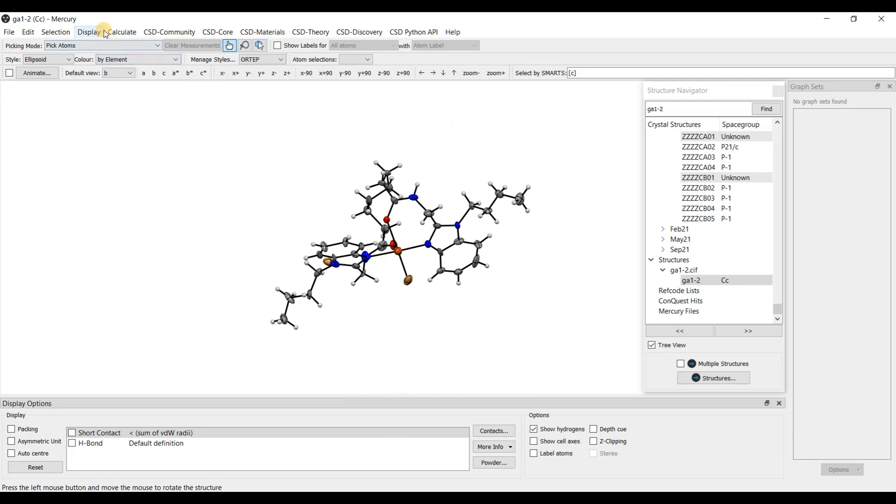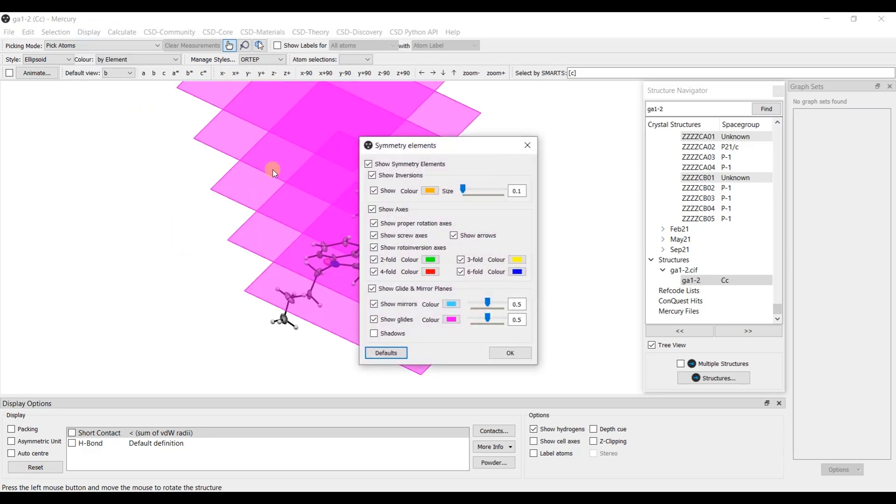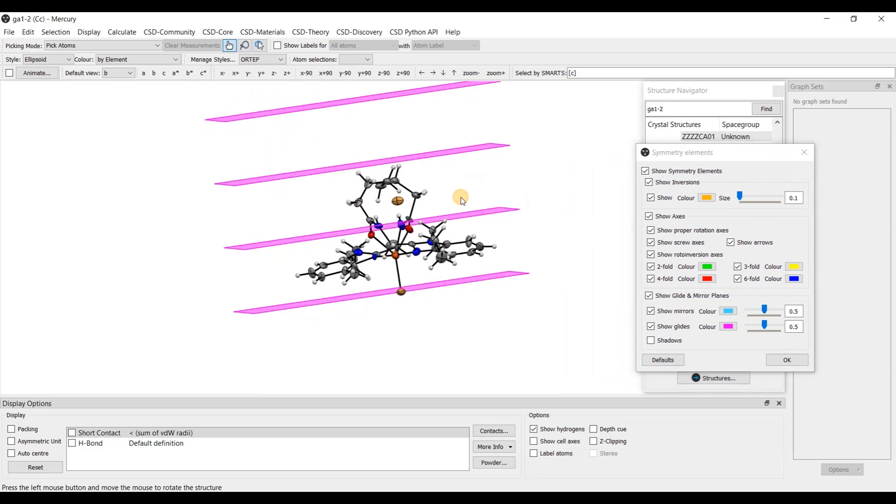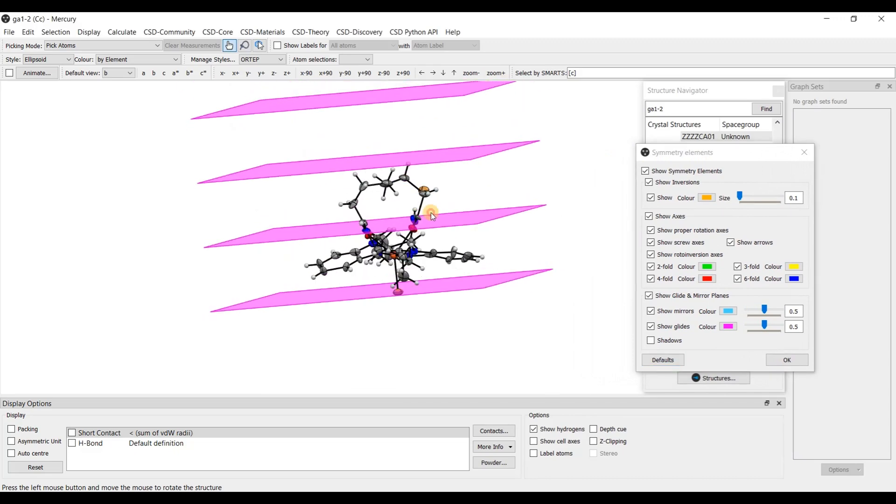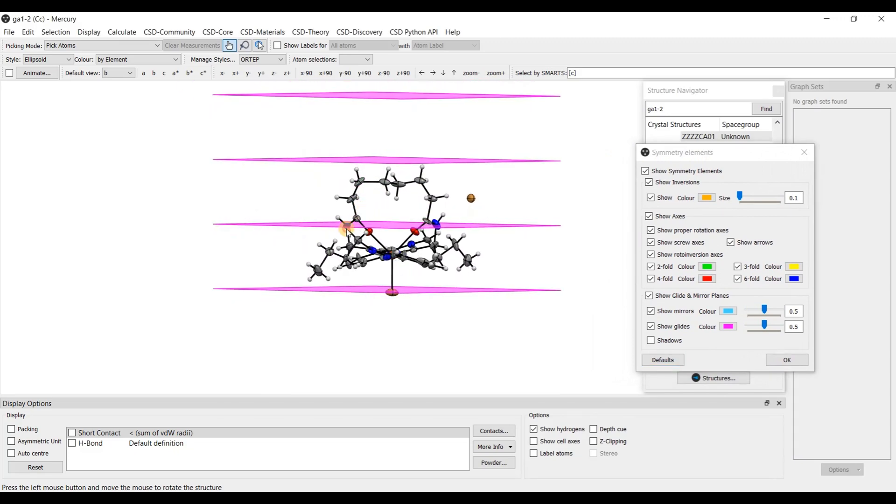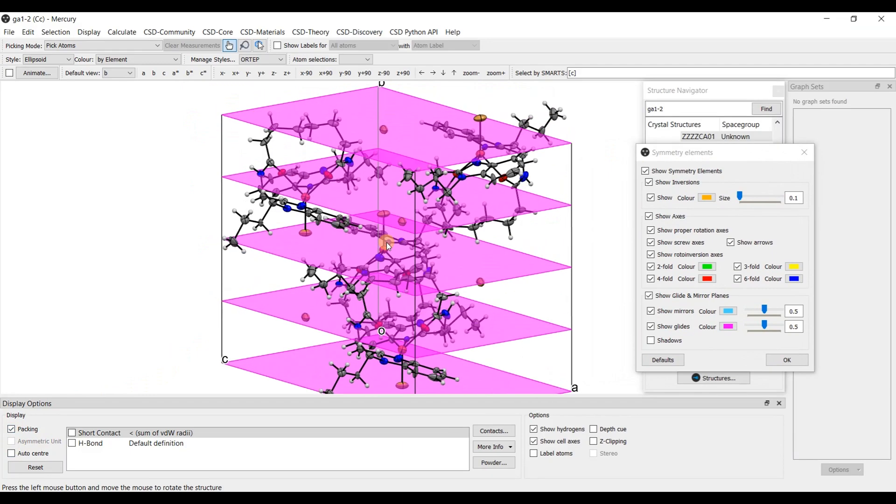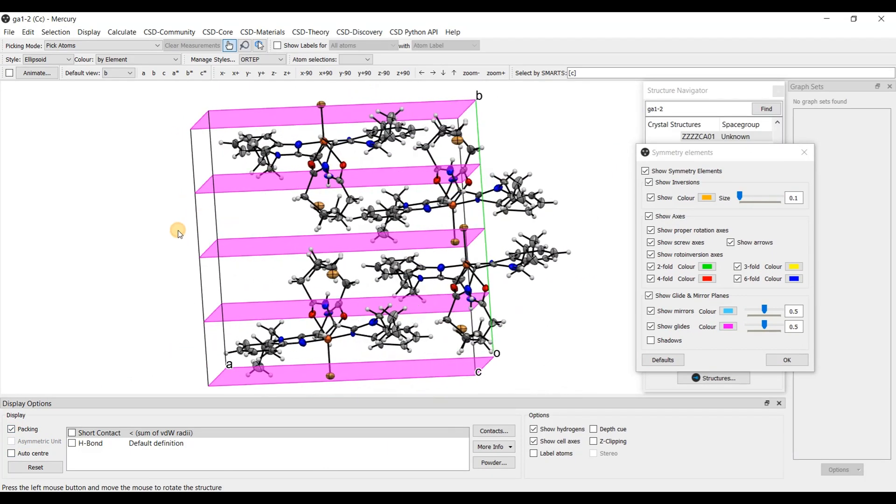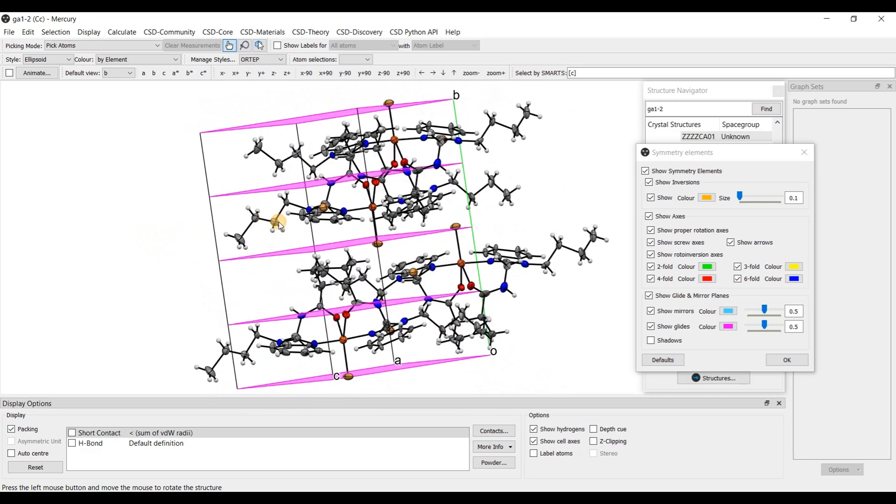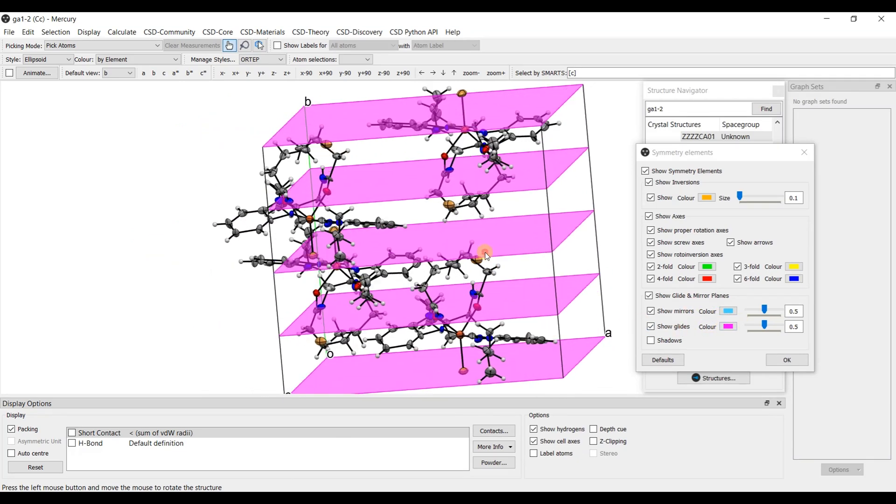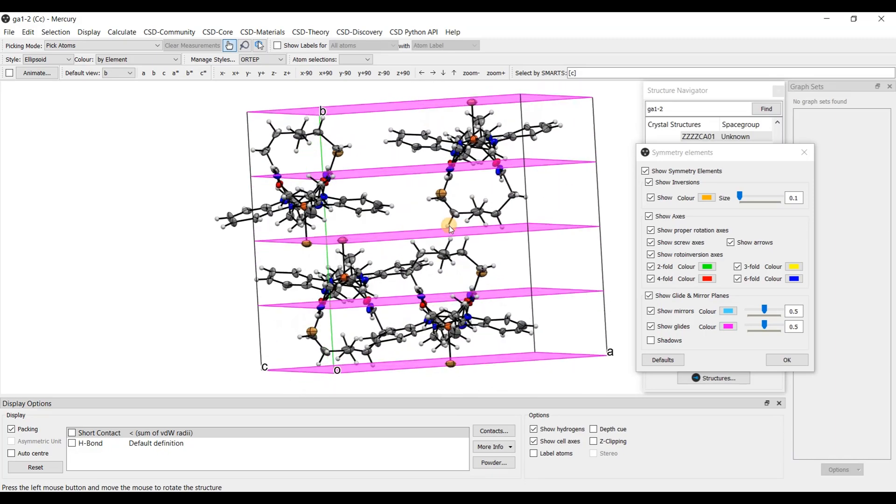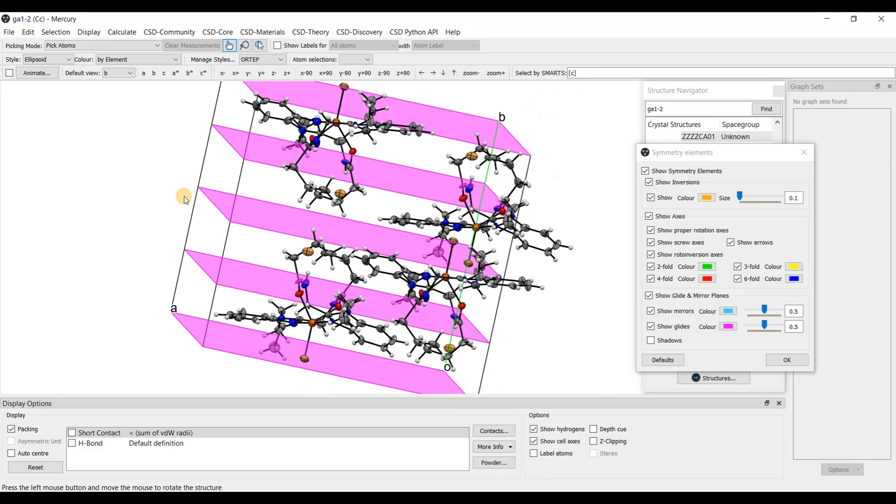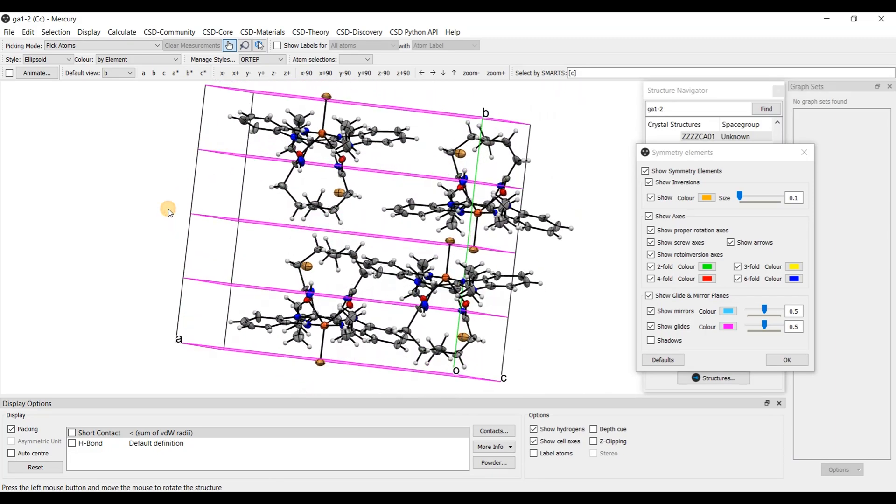I am going here display symmetry elements. And it will display the symmetry element present in the unit cell. So only symmetry element present is c glide plane.